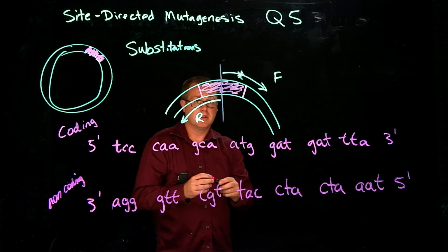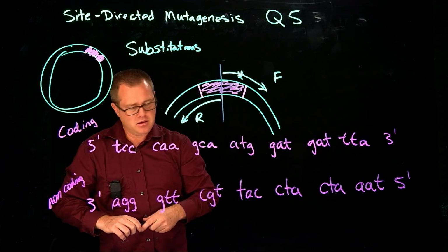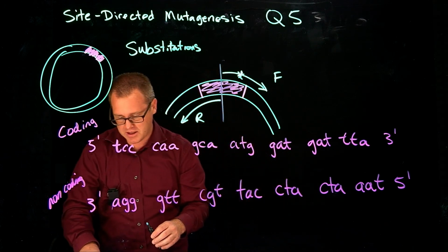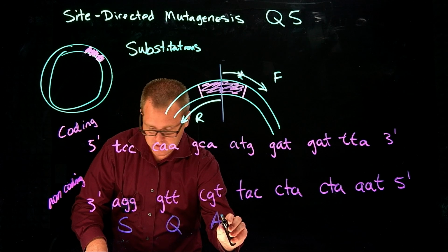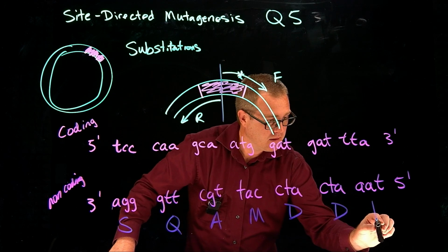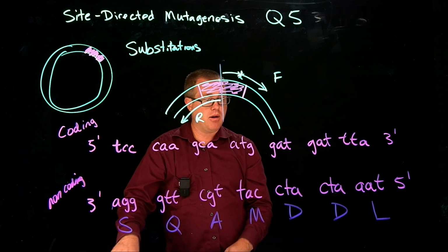There. So that is the gene that I've just zoomed in right here, okay? Now, this gene right here, let's see what it encodes for. These codons encode for a serine, like this. Right there. Okay.